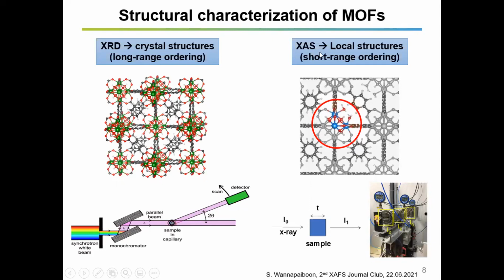With this, we can use X-ray absorption spectroscopy to focus on that metal part and extract information about the defect formation inside the crystal structures. So the combination of the X-ray diffraction technique and the X-ray absorption spectroscopy technique gives you various information that can get into the details of the mechanisms, how the MOF can react with target molecules, or how the MOF can be used as an active catalytic material performing with high catalytic activity, for example, like this.